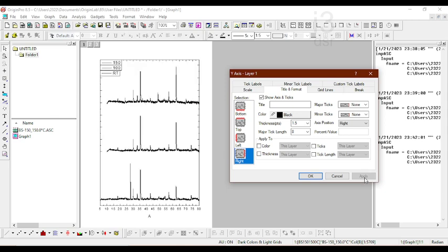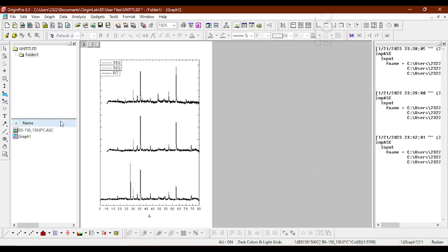You may be wondering why I have to do so much beautification. This is because your graph has to be presentable, and there shouldn't be too many lines inside that confuse the viewers. What you want to say has to be conveyed in a very precise manner. Because of that we are doing it. I'm just going to click OK. In this box everything is clear, so I'm happy. Going to just click OK.